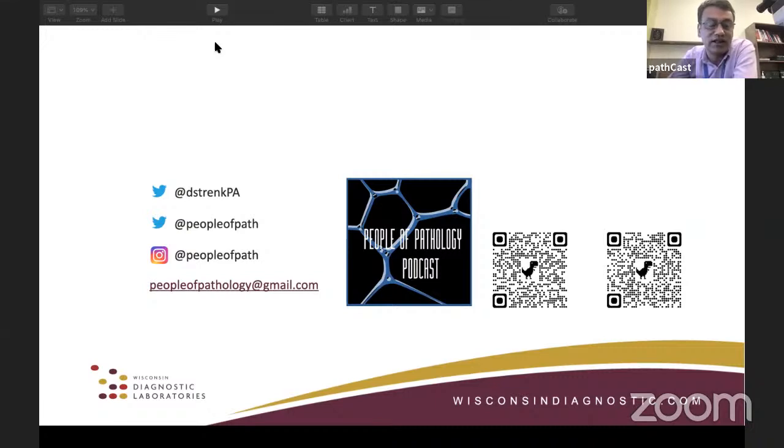But use your own wording to describe a specimen. That is how, in 1 year, you will become very expert in good description. If you use a template all the time from the beginning, then you will not be able to cultivate that skill of describing a specimen, which is very important, right?